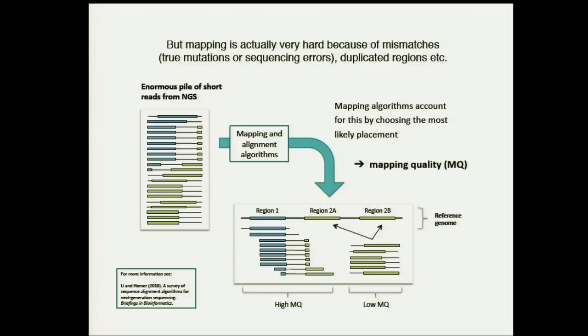So the mapping quality is a very, very important measure for you, or for the statistical machinery of the GATK, to identify errors or problems that may have happened in sequencing or just in aligning, or maybe indications that the reference genome may have fuzzy locations in the genome.